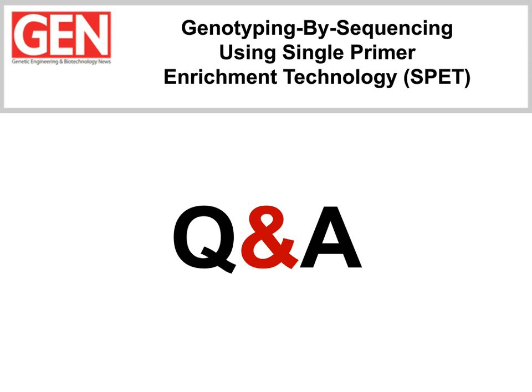And David, would it be possible to only sequence the reverse read? Yes and no. The system itself requires sequencing the forward read because it's also used for the deduplication procedure. Basically, the deduplication happens by means of those 6 bases, which are random, degenerate, after the barcode index. And that information, coupled with the position of the forward read, provides an unambiguous deduplication of mapped reads.